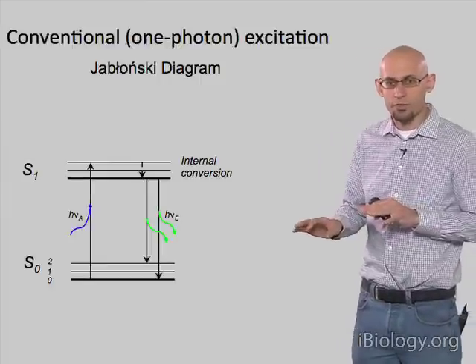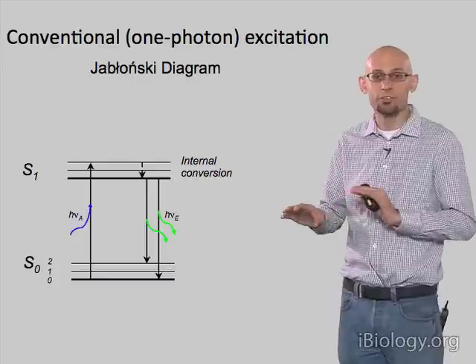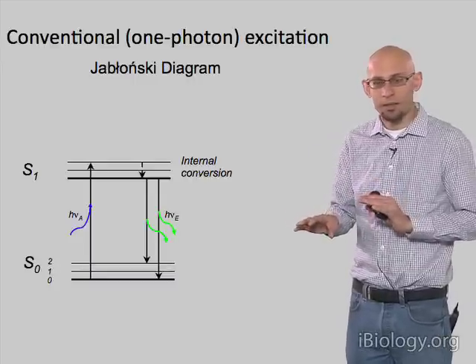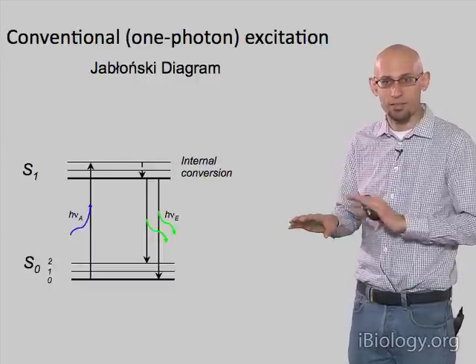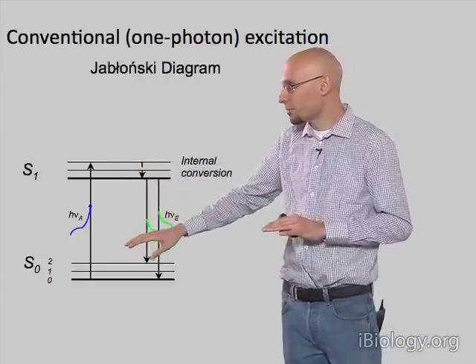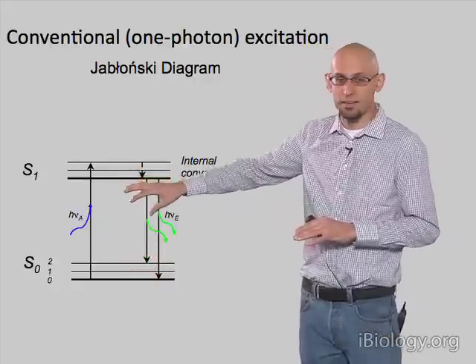So to explain how this works, I'm going to take a step back here and talk briefly about conventional excitation in microscopy. And Nico, I believe, has a lecture on fluorescence microscopy that explains some of this. And the idea here is that your dye has 2 energy levels, the ground state here, this S0 state, and the excited state, S1.